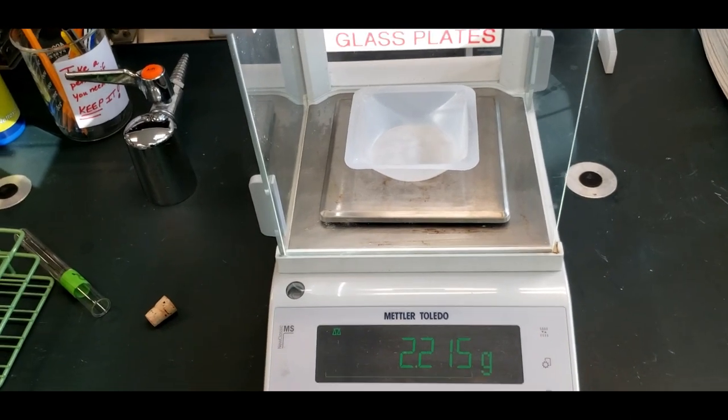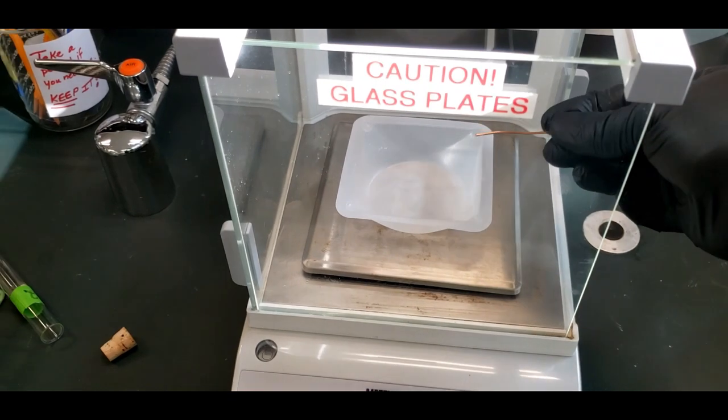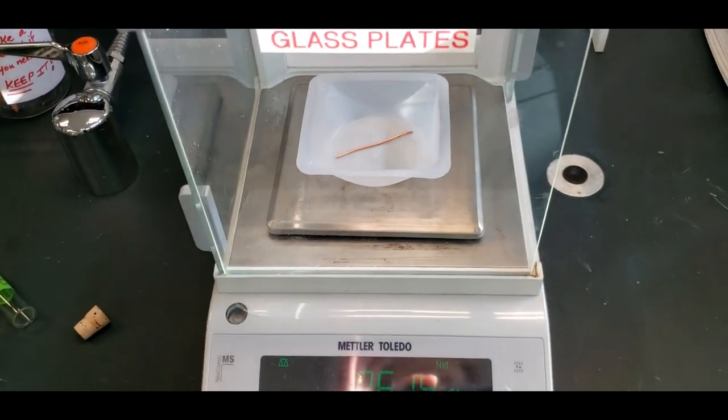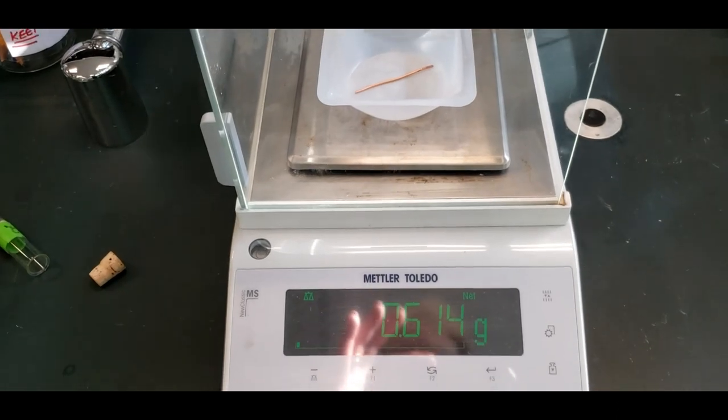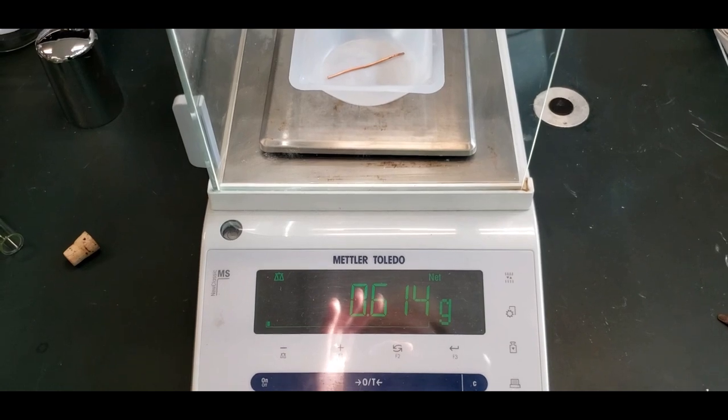We're going to weigh the copper sample. Got a weighing boat in there. It might roll off, so do that. And we have 0.614 grams for the copper.